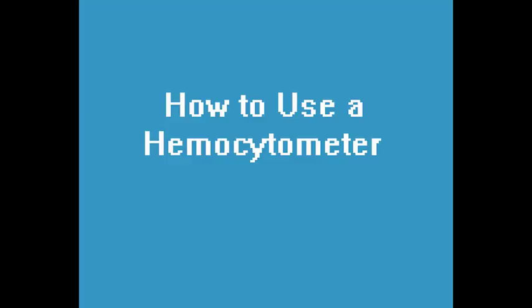How to use a hemocytometer. In this video, we will demonstrate how to use a hemocytometer to determine the cell density of a culture.